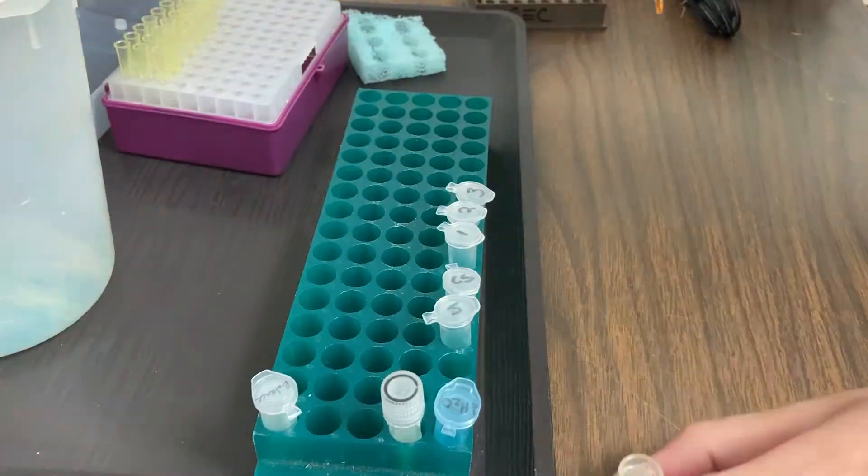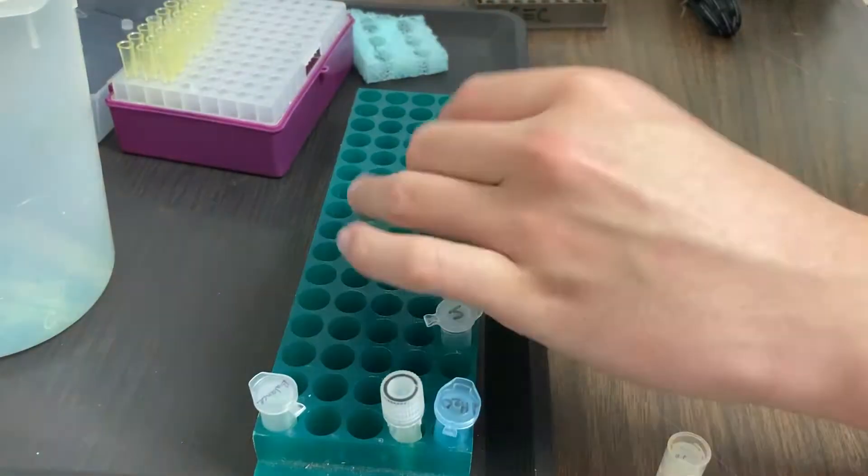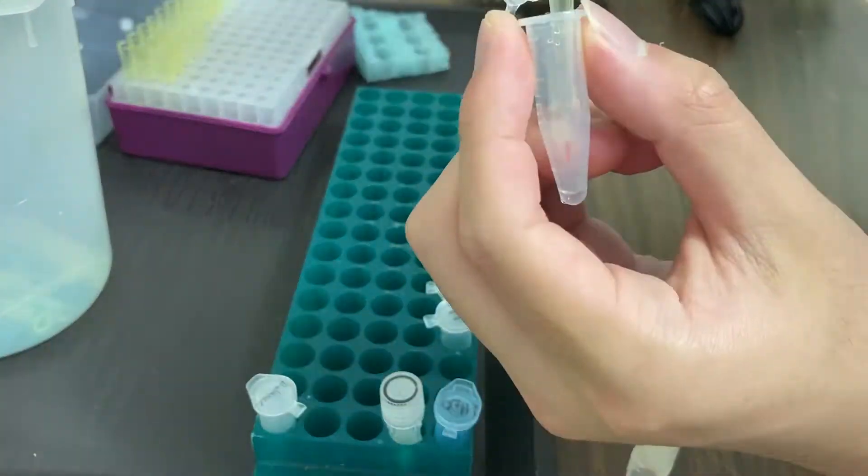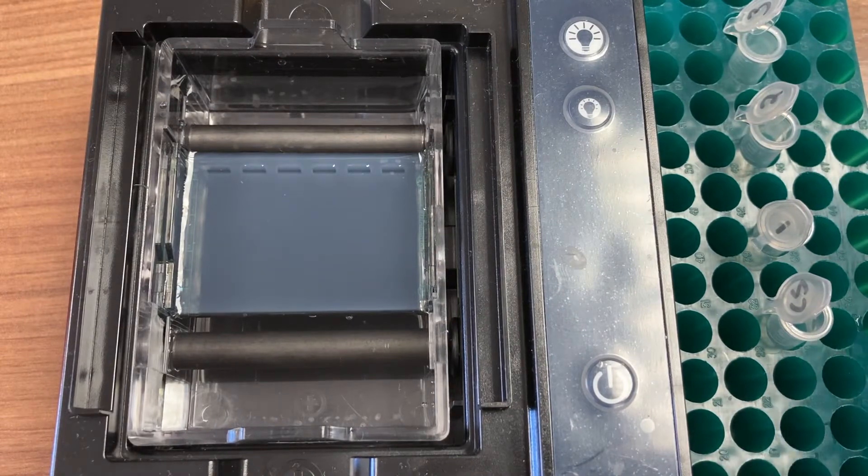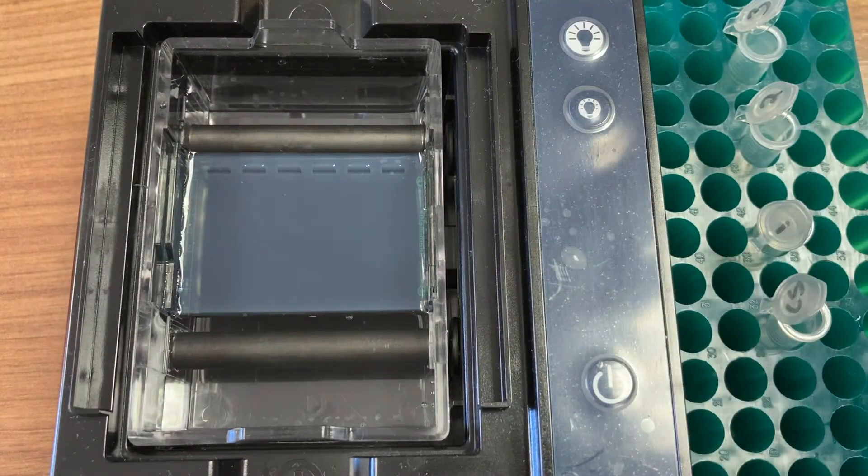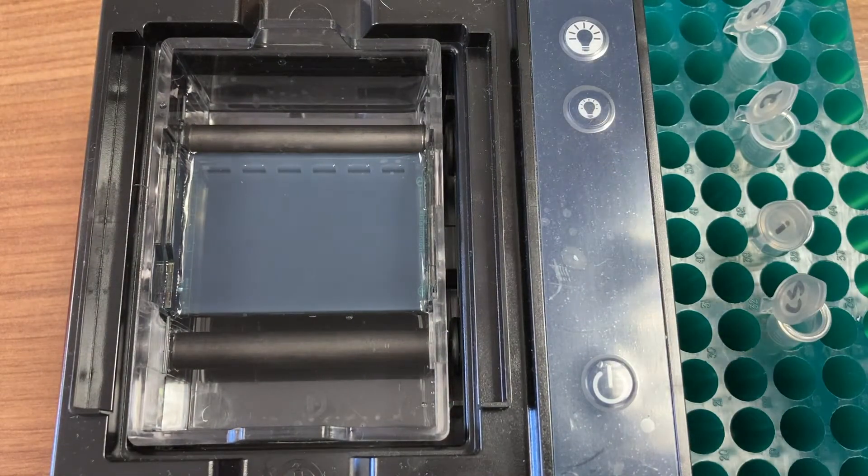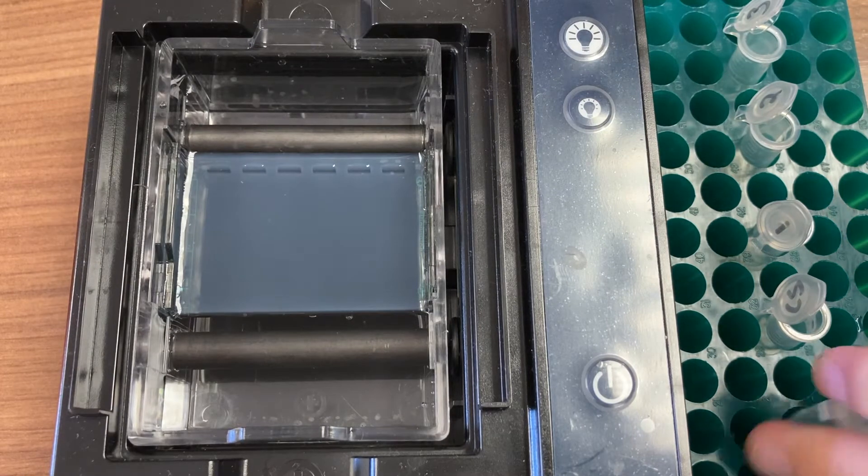We've finished adding our loading dye to each sample, and now we're ready to load our DNA onto the agarose gel. We're going to add our samples to the agarose gel that's here in the electrophoresis system. You can see it looks a bit like jello sitting in there.